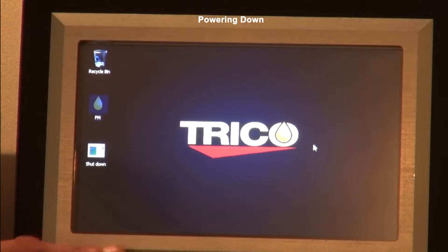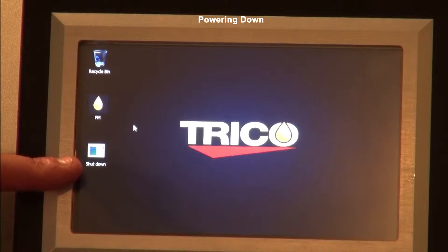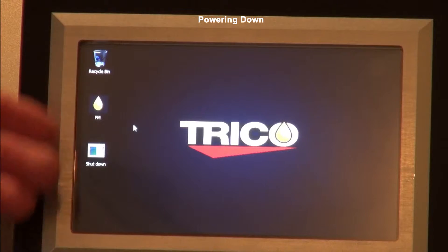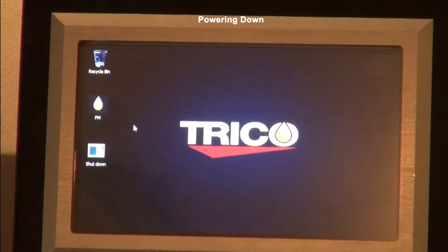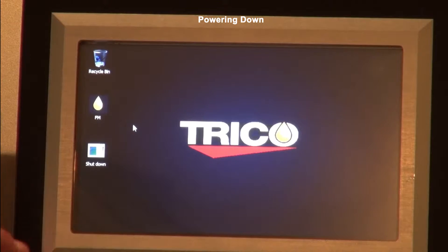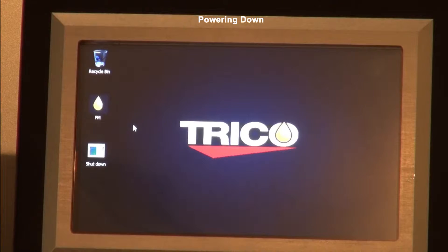On the Windows desktop you have both the FM icon and the shutdown menu. The shutdown menu goes through the routine of shutting down the entire Windows without you actually having to go down to the start menu and press it. All you have to do is double tap the shutdown menu and then wait until the unit fully shuts down.